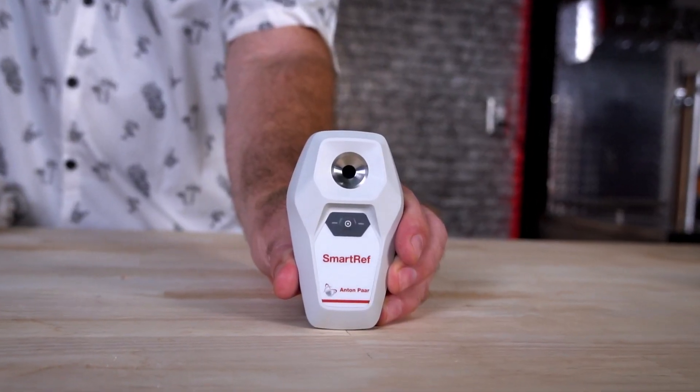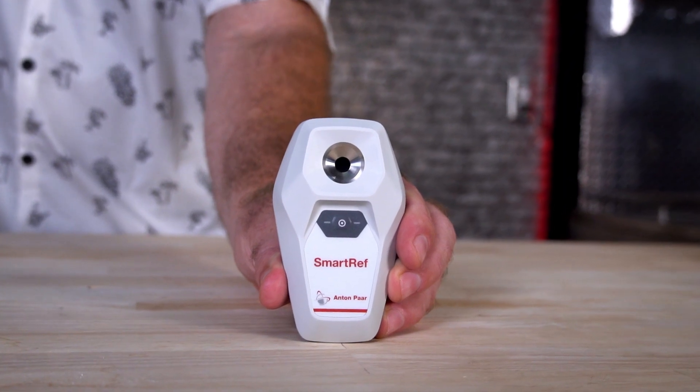We're going to go over the Anton Parr Smart Ref today. It's a digital refractometer that's highly accurate, and to my knowledge, it's the only refractometer with alcohol correction built into it.